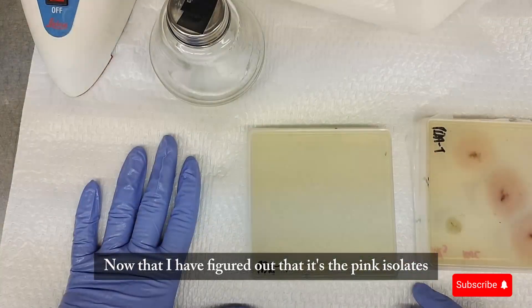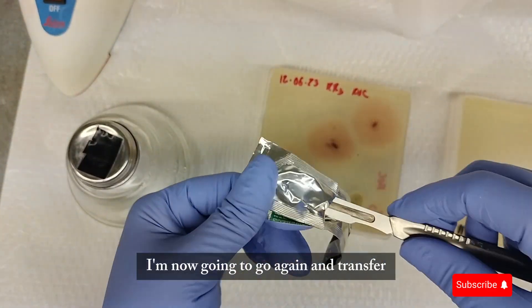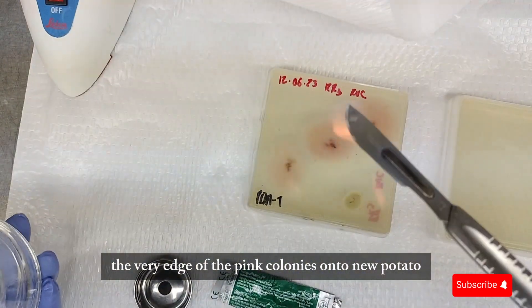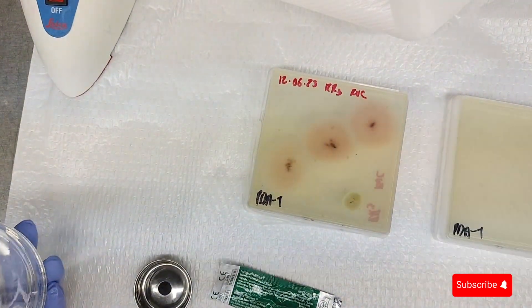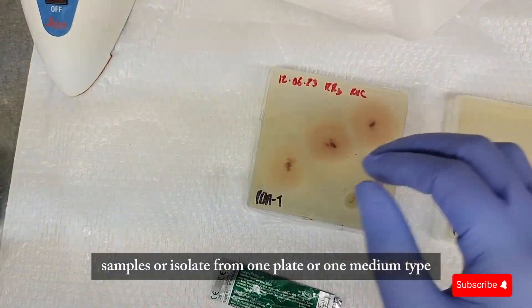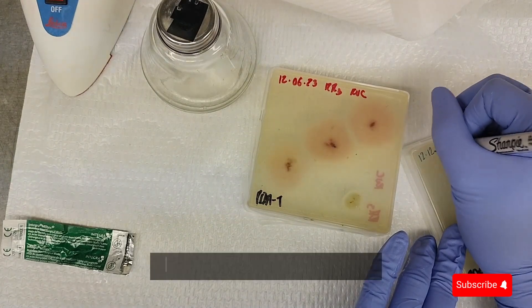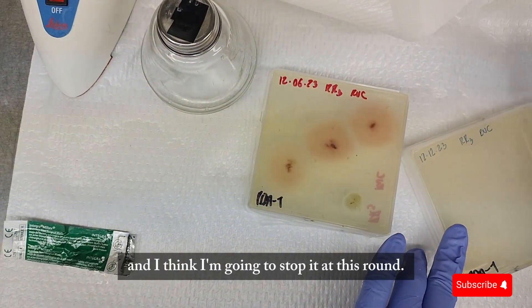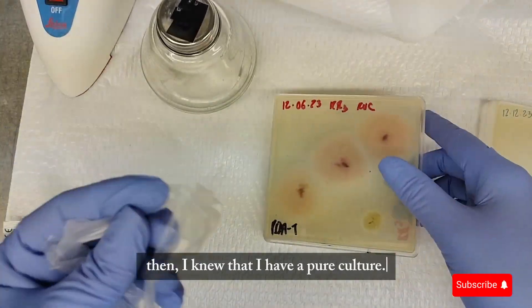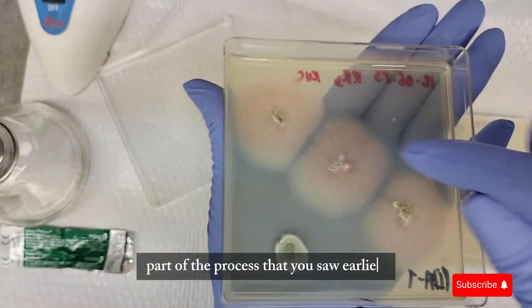Now that I've figured out it's a pink isolate responsible for the fuzzy growth the team saw on the plant, I'm going to transfer small pieces from the very edge of the pink colonies onto new potato dextrose agar plates. This step is called subculturing — it's just a series of transferring samples or isolates from one plate or medium type into another. If on the new plate only pink colonies grow, then I know I have a pure culture, and that's good enough.